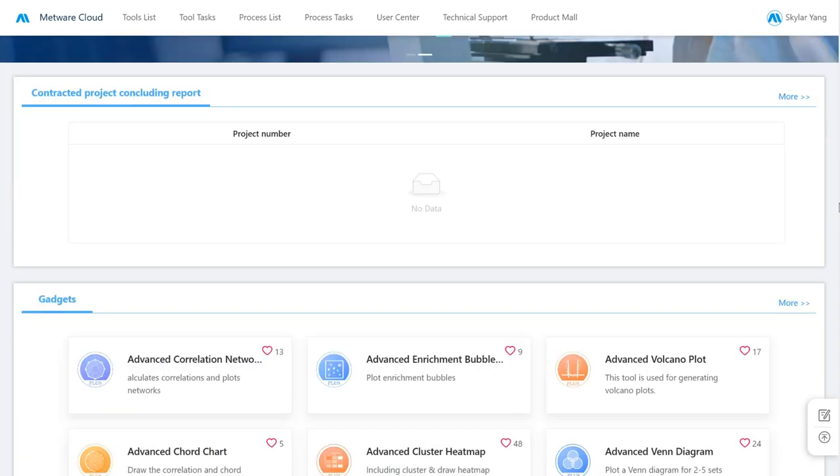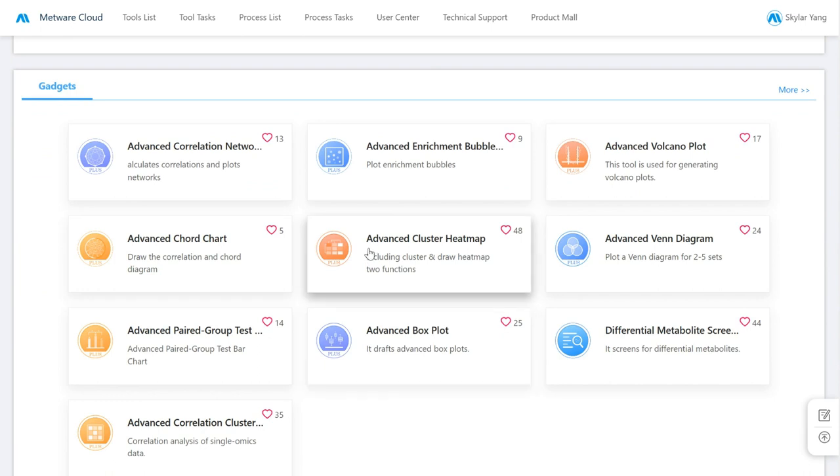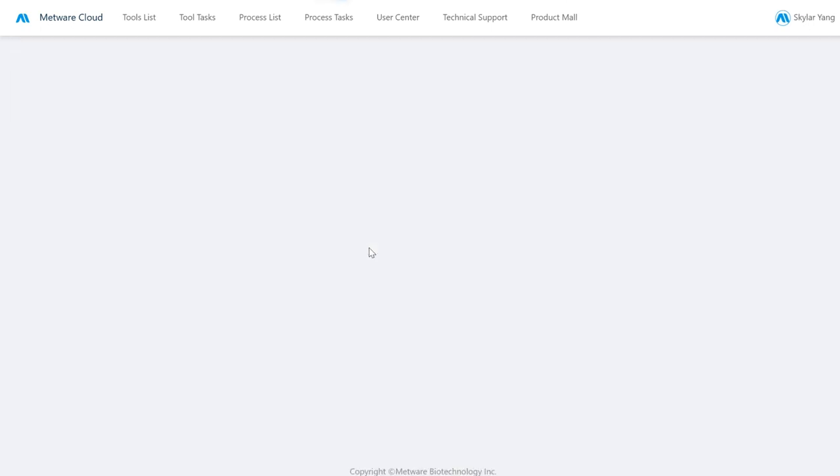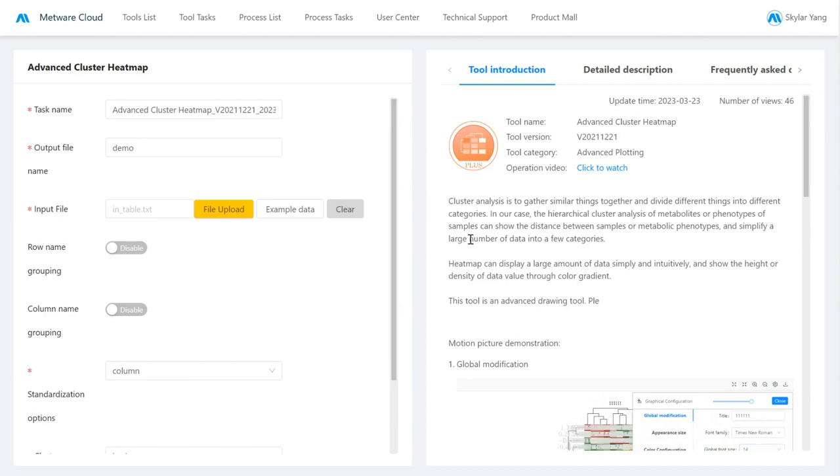So first of all, we see a list of all the tools that we have available, and we will just select the tool that we want. And here we see the interface of the tool. We see that our interface is split in two. We've got a right column and a left column.